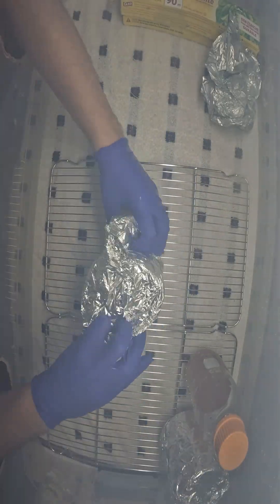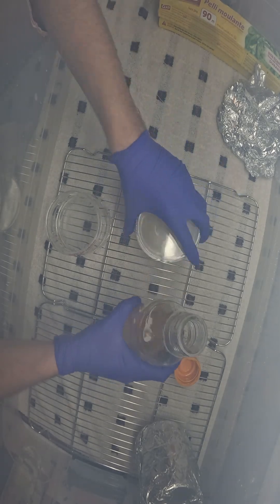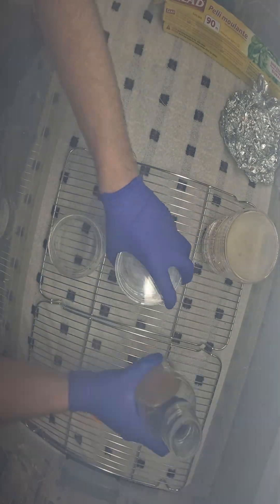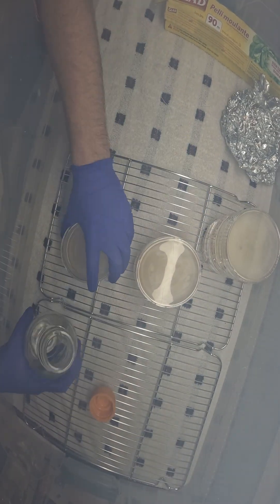Transfer all your petri dishes and your agar into your still air bin. You're going to want to pour 1/10 of whatever agar you've prepared into each of the petri dishes. You can see here I do this relatively quickly — it is sped up — but the method I use allows me to pour relatively quickly without exposing them to the air for too long.